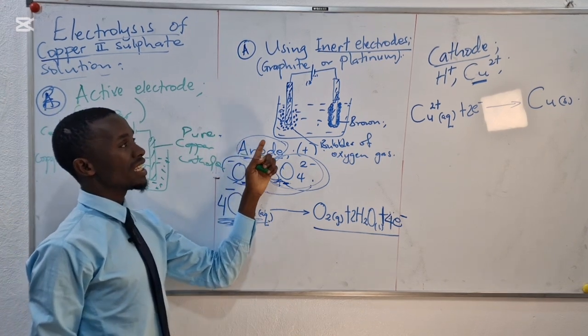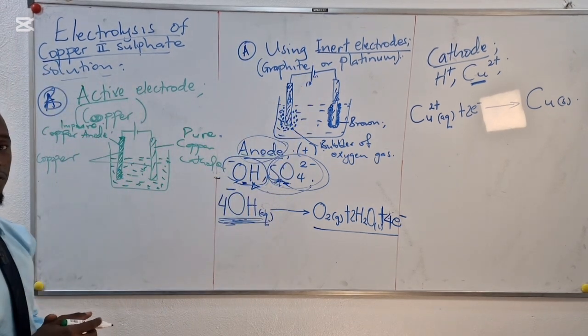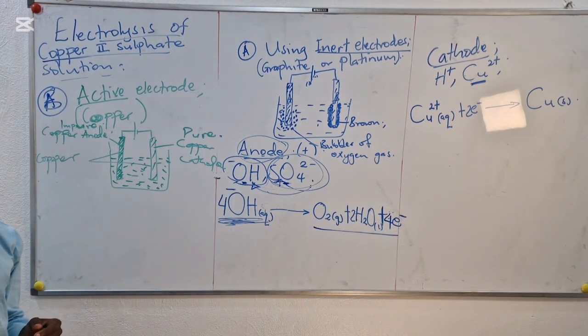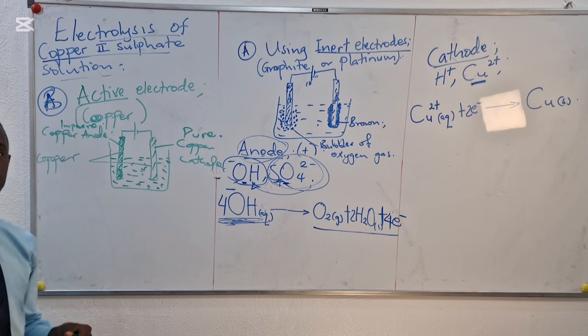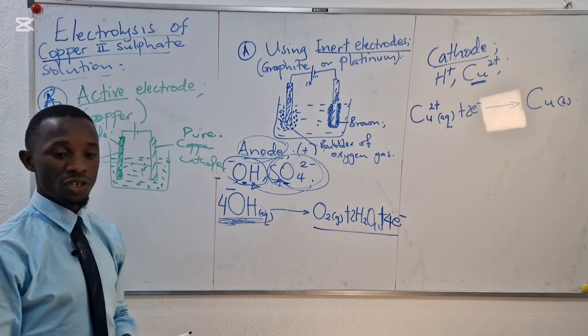However, since we are using an active electrode, none of them will be discharged. Now, the factor is different, it is the type or nature of the electrode.